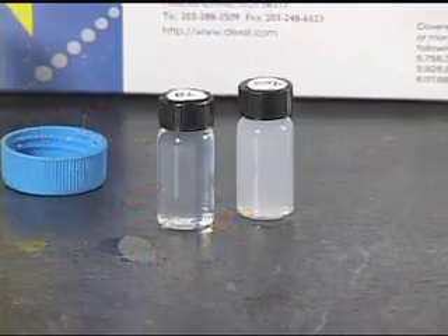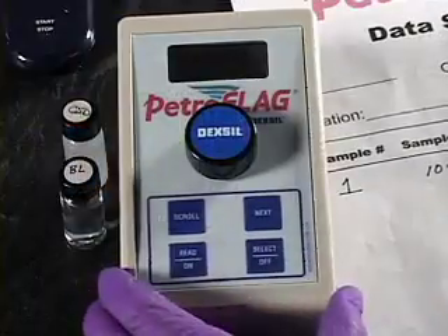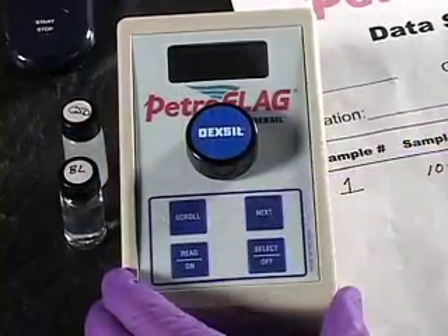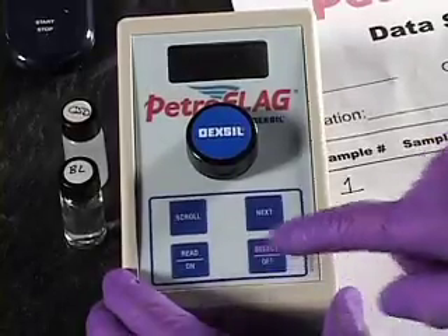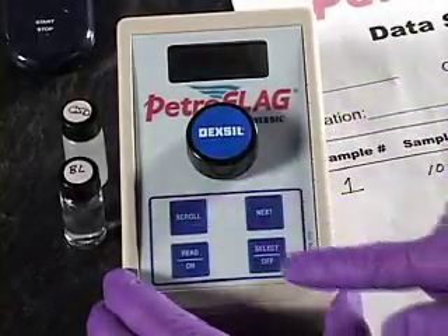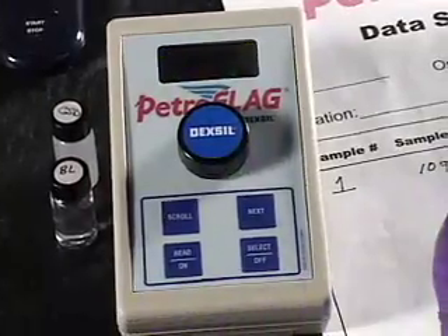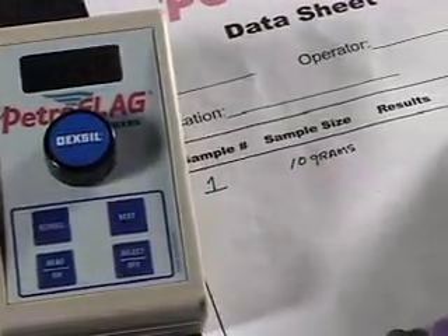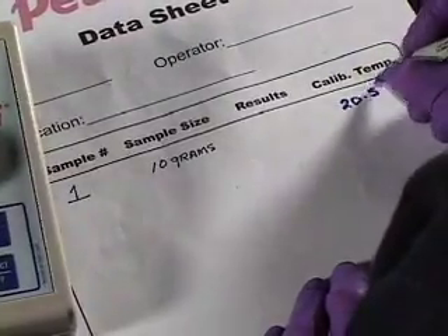Set the timer for 10 minutes. A few minutes before the 10-minute waiting period is up, prepare the PetroFlag meter by choosing the correct response factor from the program menu. After selecting the response factor, the instrument will display the ambient temperature. Be sure to record this number. Do not go beyond this screen until the 10 minutes has elapsed.